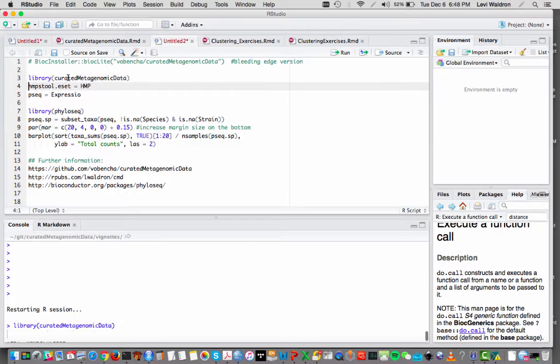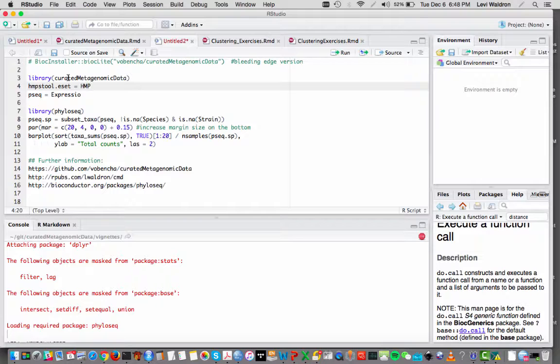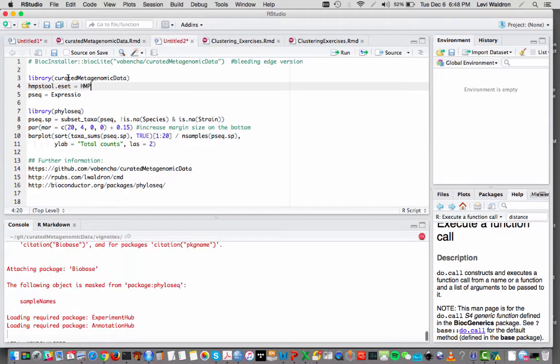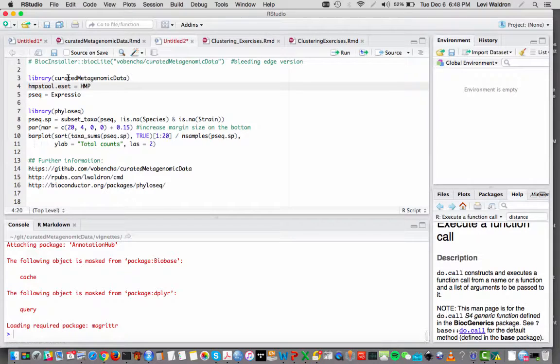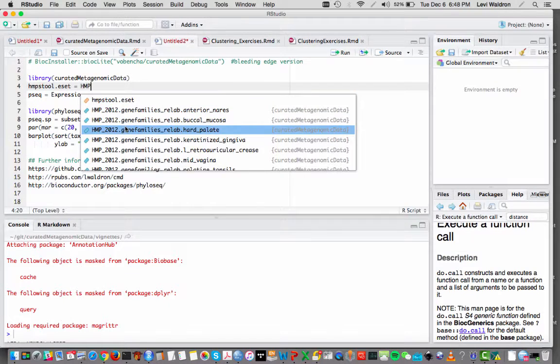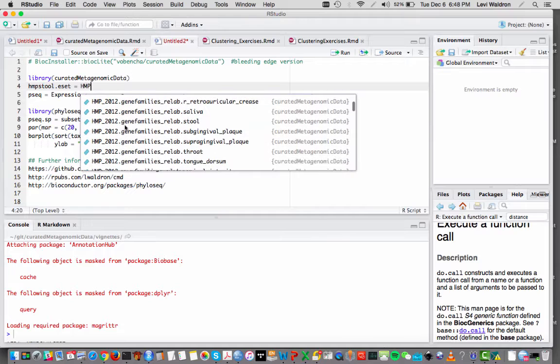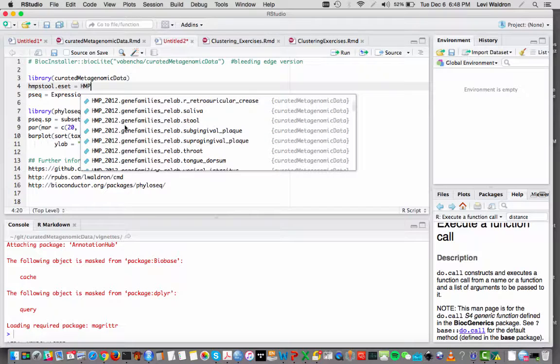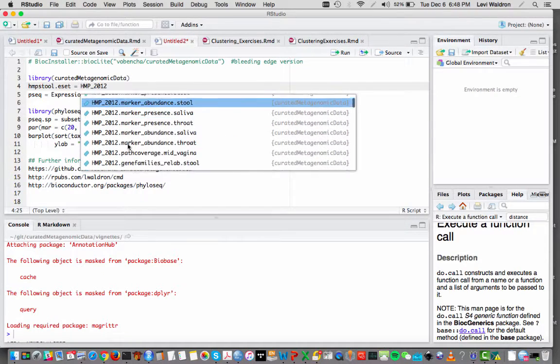So I load the curated metagenomic data package and this will provide all of those functions exported shown in that reference manual. They can be auto completed. So I'm going to pull out, I'm looking at all of the HMP functions here. I'm going to shorten it a little bit.